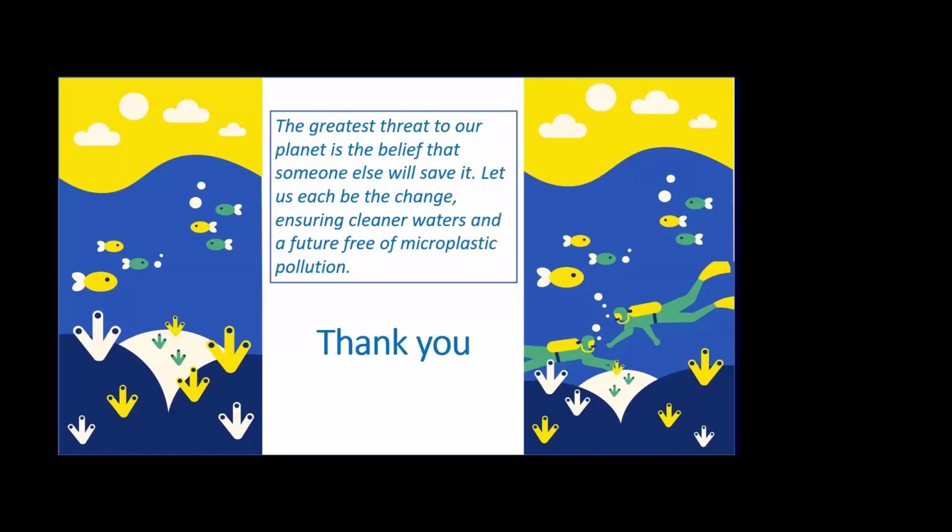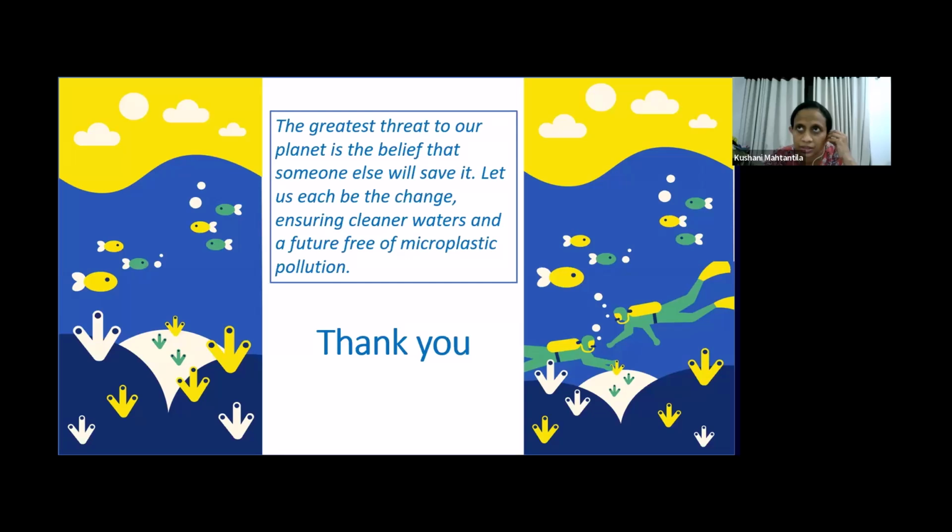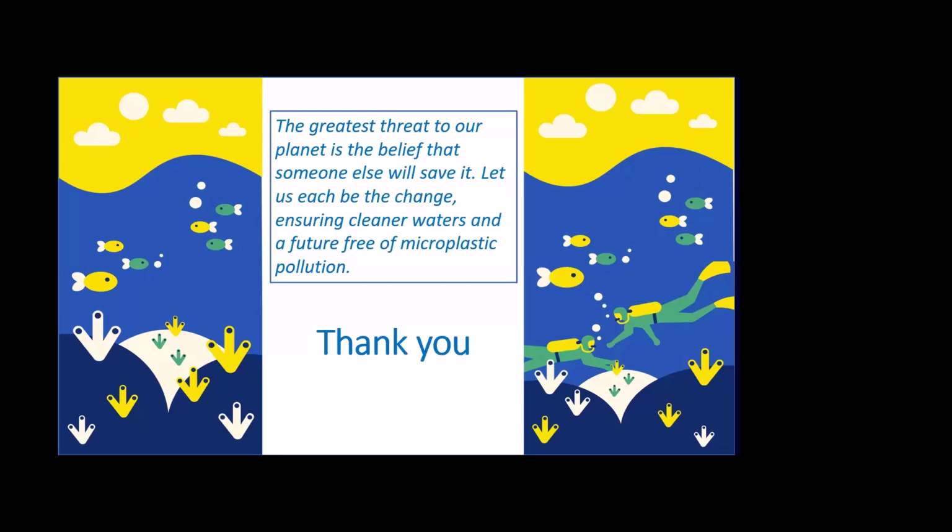Ma'am, I do have a question. In your presentation, you mentioned many detection techniques by which we can detect and quantify microplastics. My question is whether by means of any HPLC system we can detect microplastics.